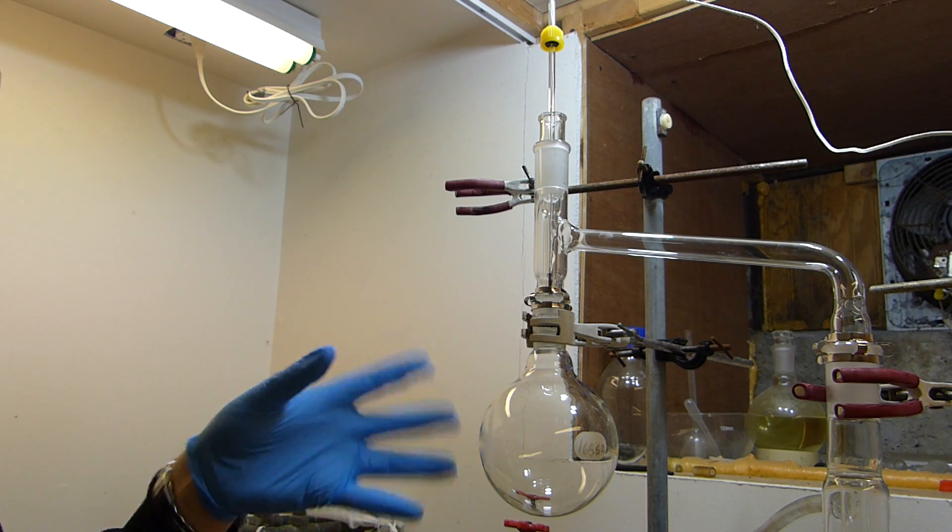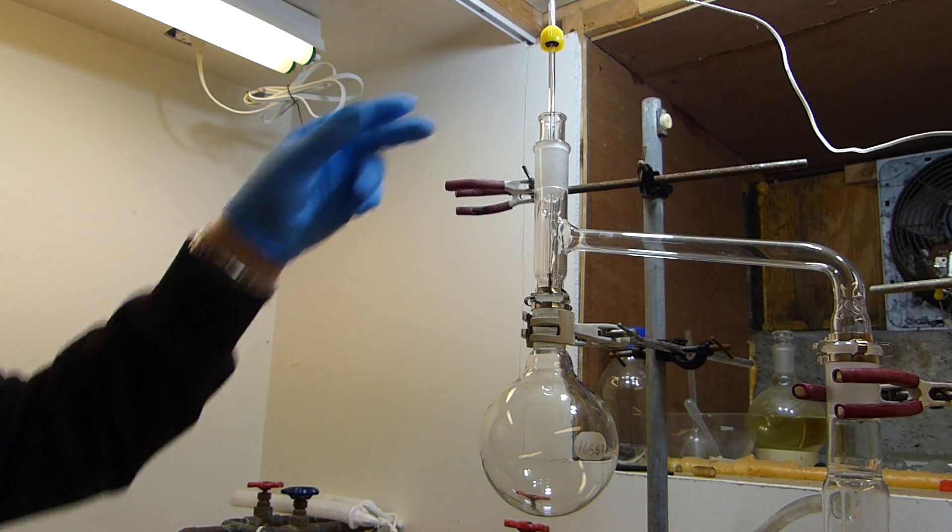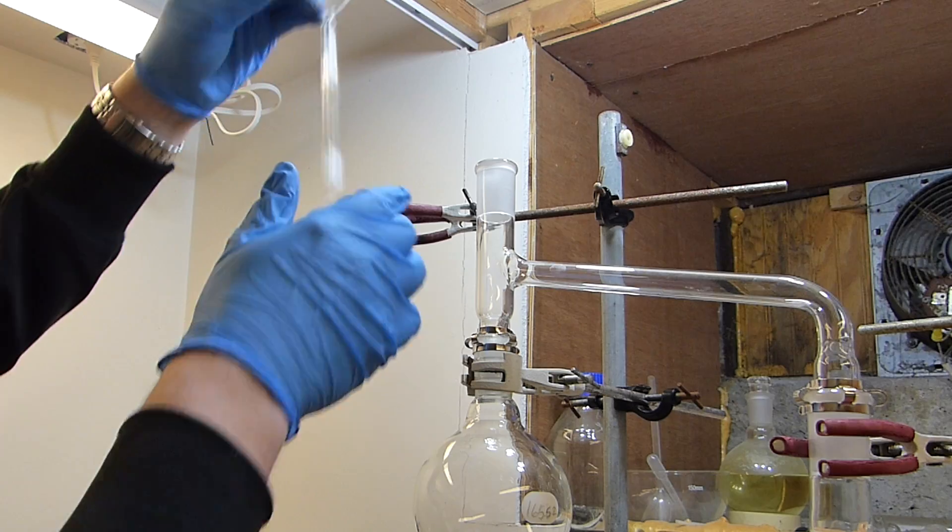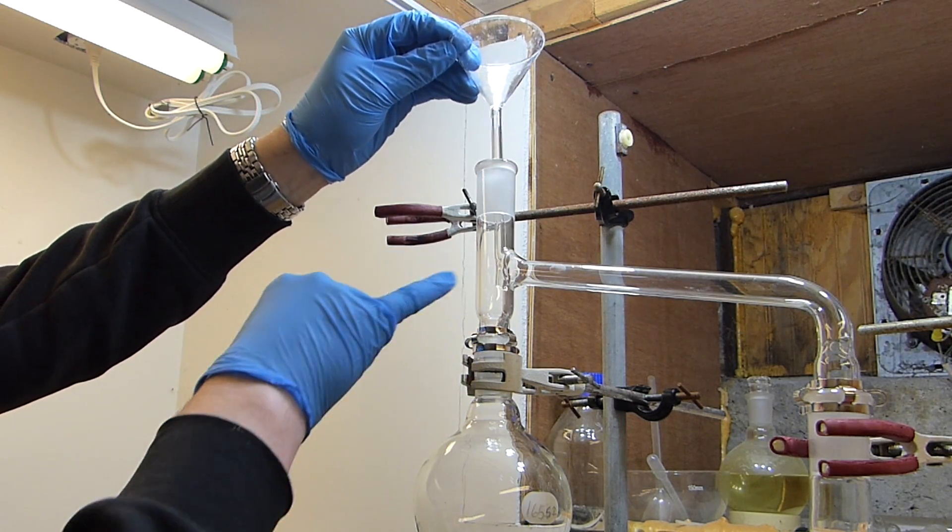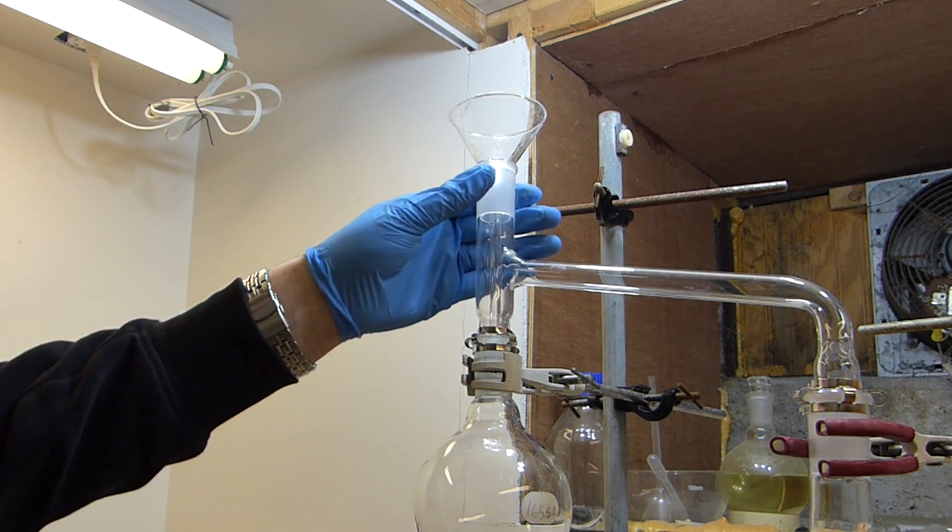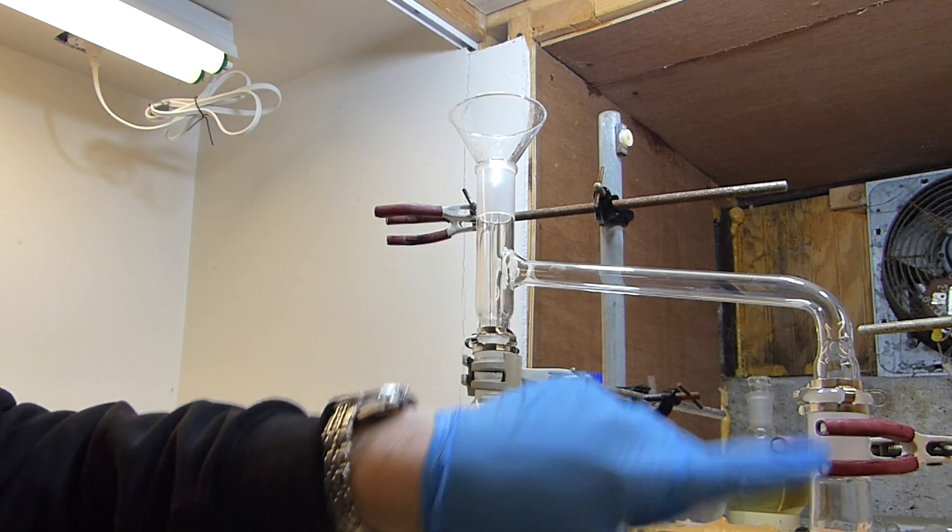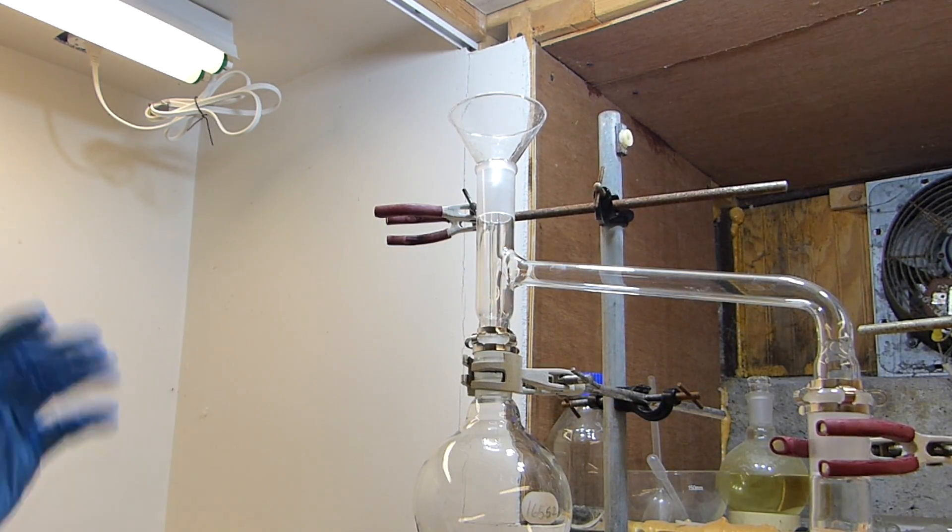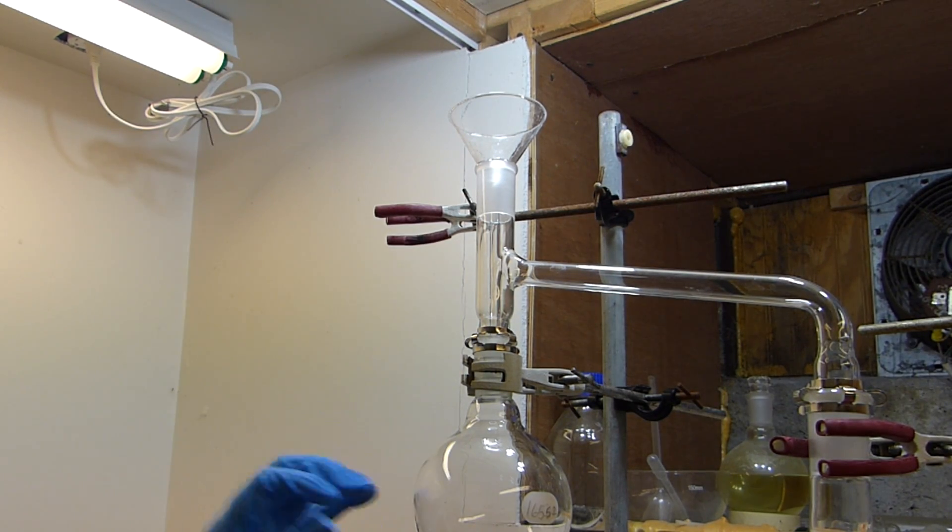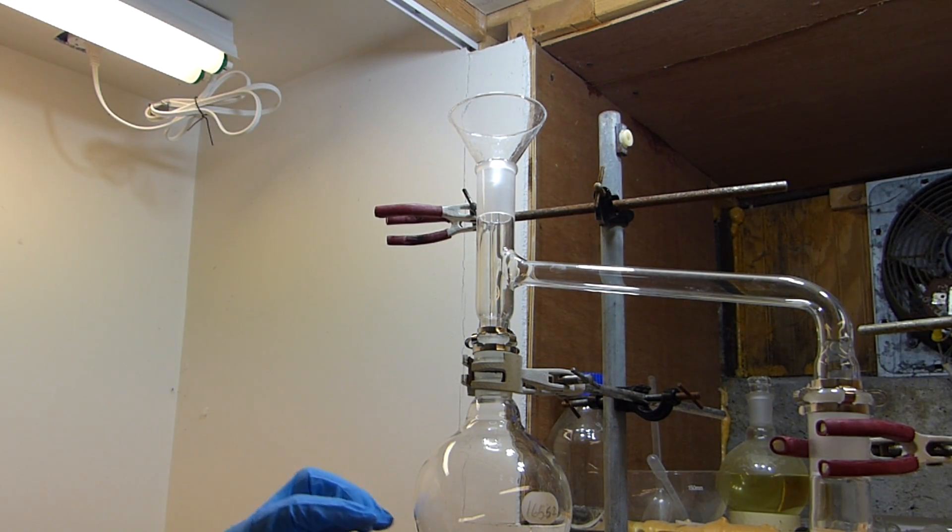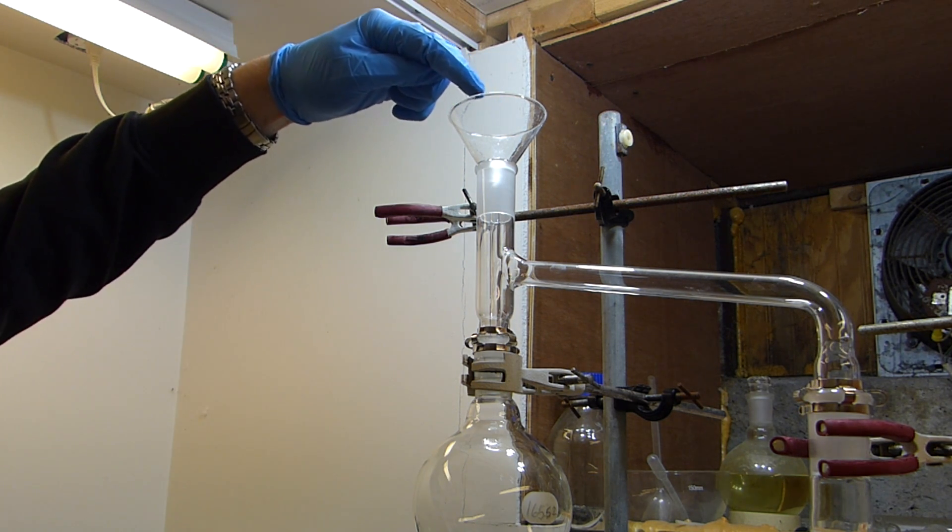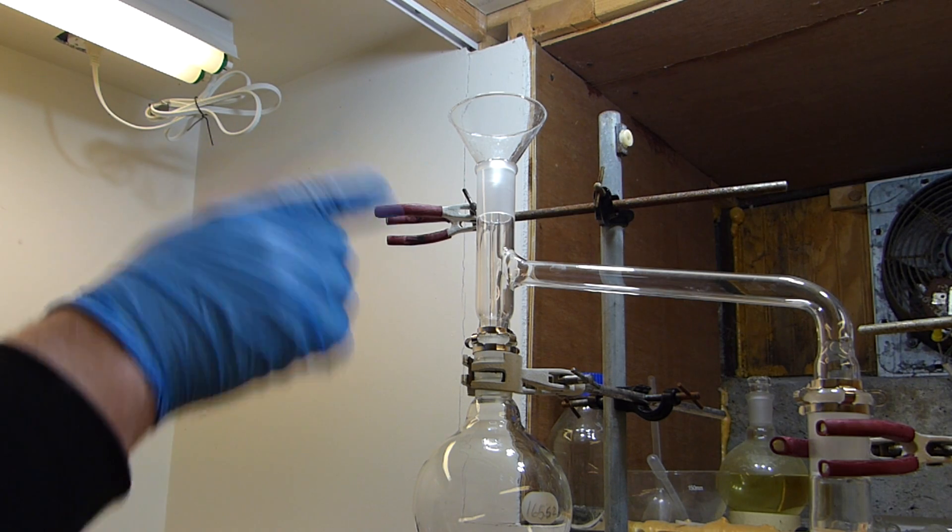This apparatus is set up in a special and rather clever way. What I can do is remove this thermometer well right here and take the thermocouple tube out of it. Now this funnel, you'll notice the stem goes past the sidearm here on the still head, which means that I can charge the acid without risking getting dirty acid into the clean side.